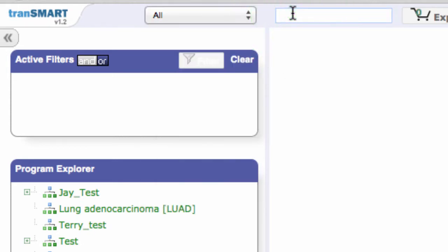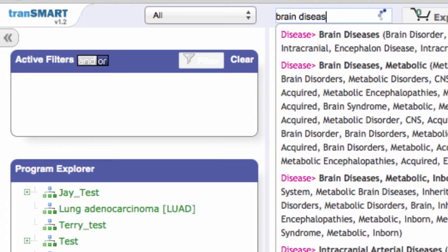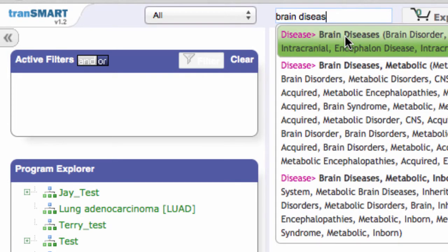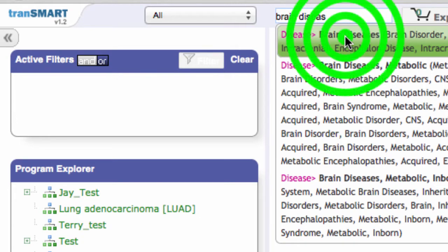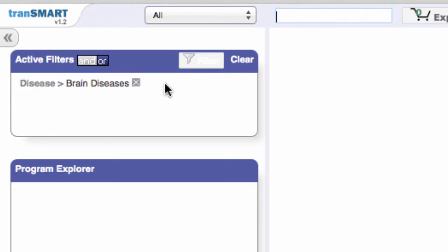Type search terms into the Browse bar, such as brain diseases, and select from TransSmart's suggestions. Your search terms will appear in the Active Filters box.